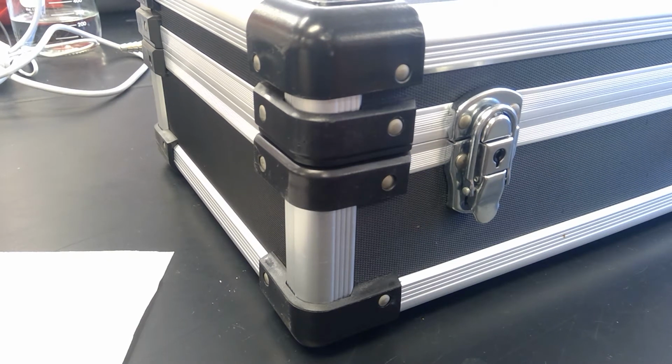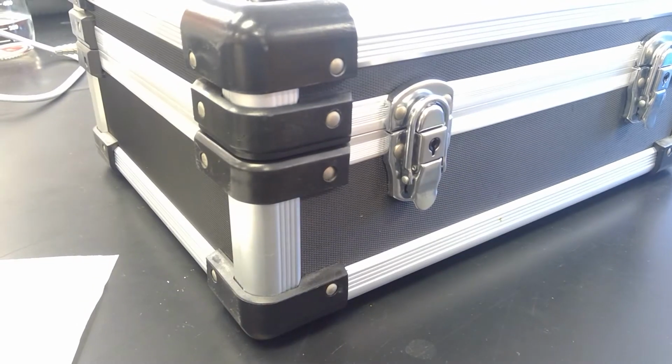The last part of the physical properties we have is the refractive index. So what you're looking at now is the case to the refractometer. The first thing that we need to do is look in the CRC for literature values.